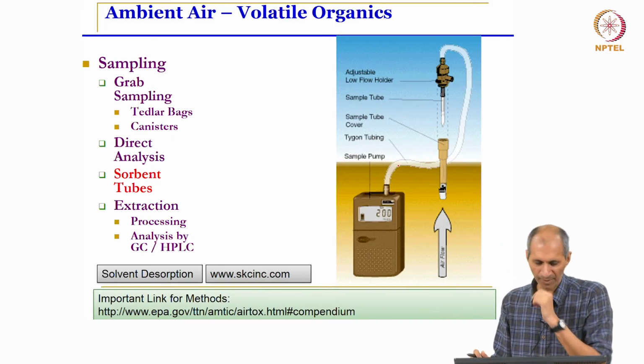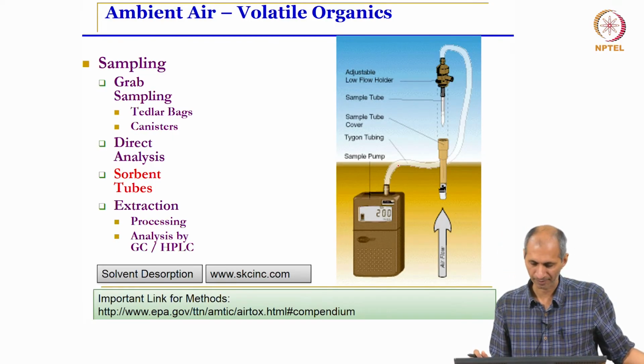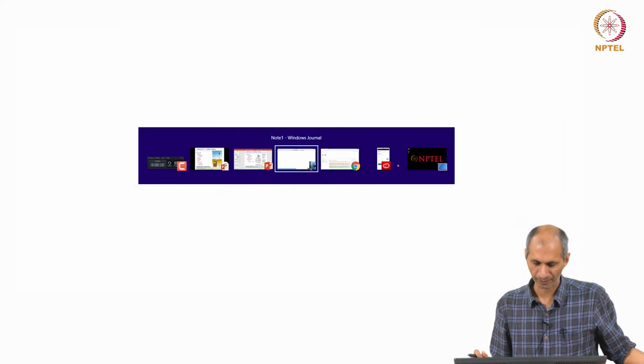So typically when you place a sorbent tube like this, this is a pump and the tube is placed here.